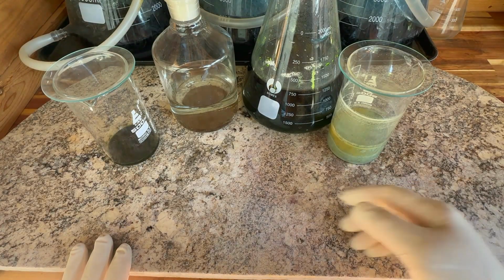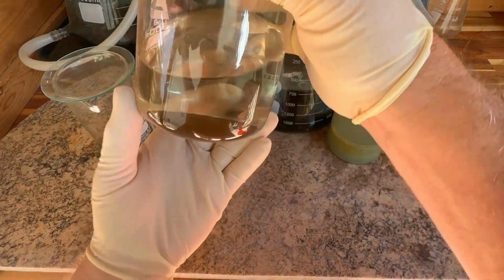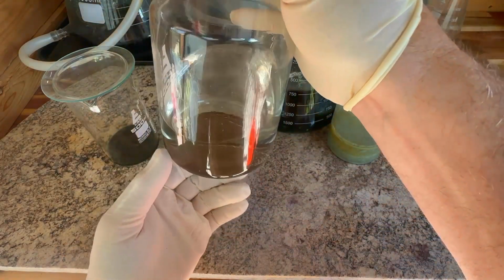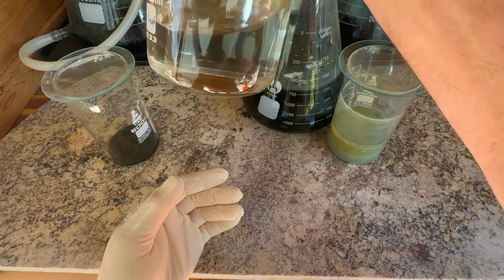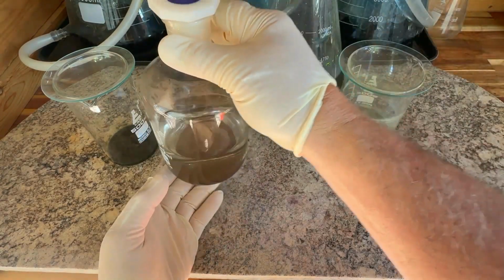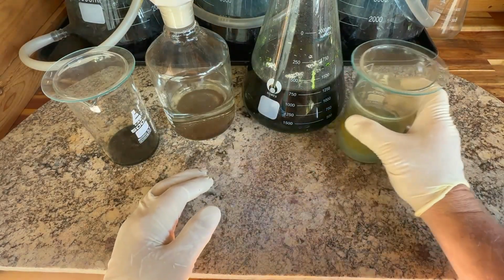Second, we have the contents of my temporary stockpot. This comes from washing of gold powder. Every time we do that, a little bit of powder will come over, along with some of the light contaminated stuff. We let it settle, decant off most of the liquid, and we're going to go ahead and process that and clean it up as well.